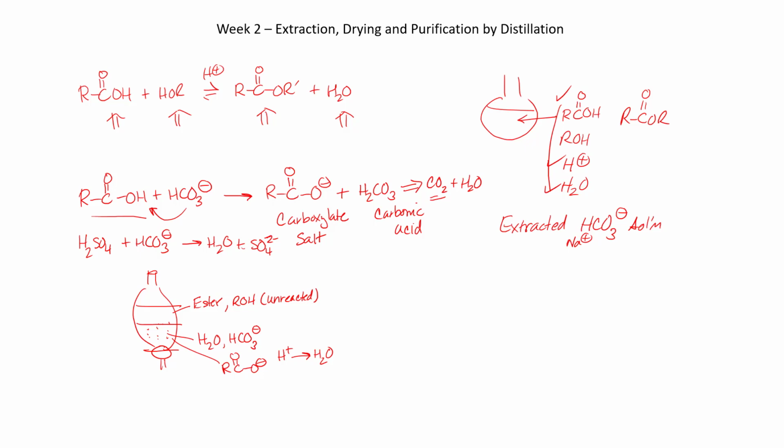I would have cautioned you about that in the lab, that if you added the bicarbonate, immediately put the cap on, and started shaking, you would be wearing most of your product home. And with my luck, I would have been standing right there, and so you would have sprayed me with your product as well. So fortunately, I guess we didn't have to worry about that, but this is what the extraction, our first step, would have done: it would have removed everything but ester and alcohol.